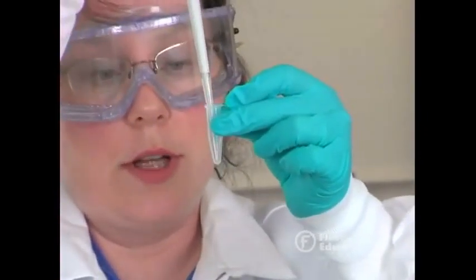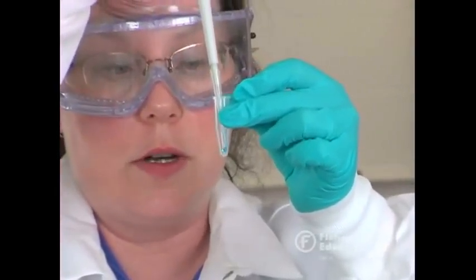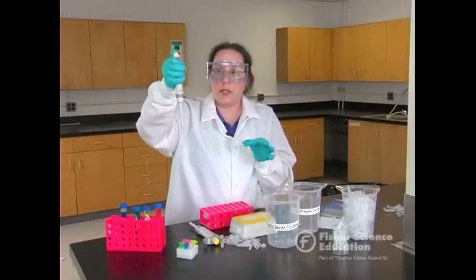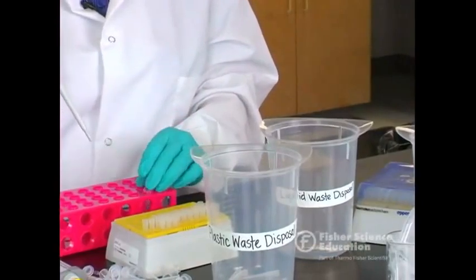When they dispense, again, everything at eye level, they do want to touch because we want the water to stick to itself. And so we're going to go to the first stop and second stop. Keep your thumb pressed down, then release and dispose of your tip.